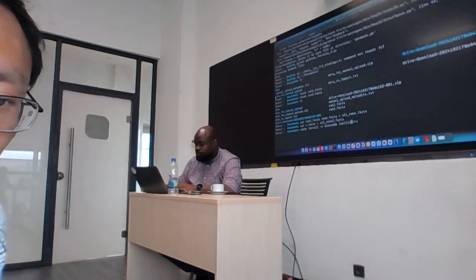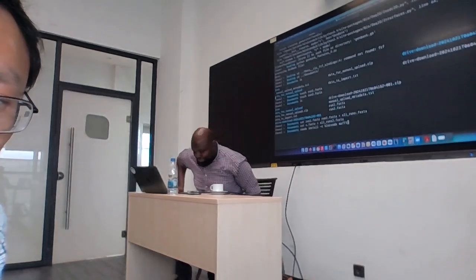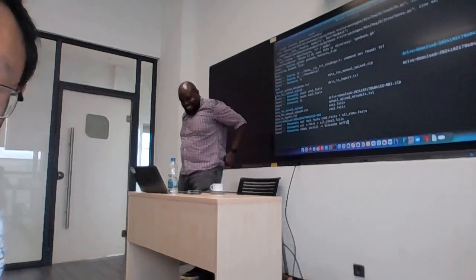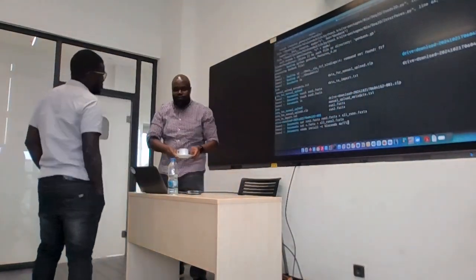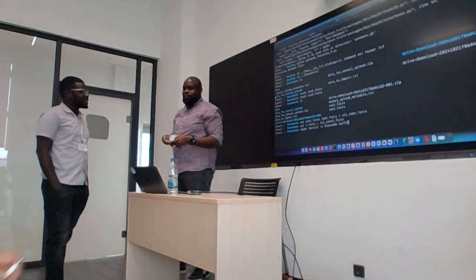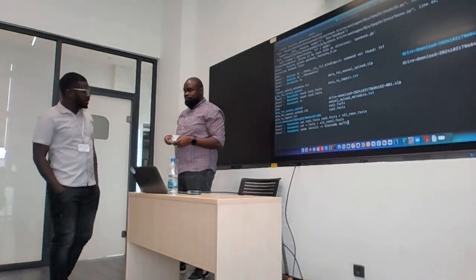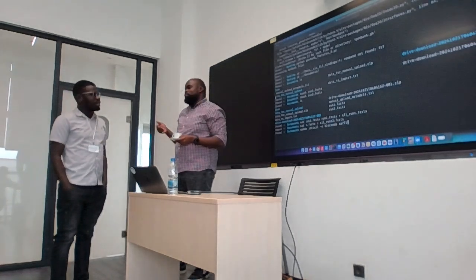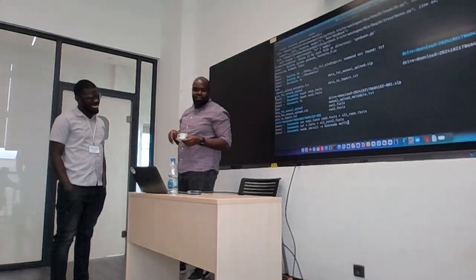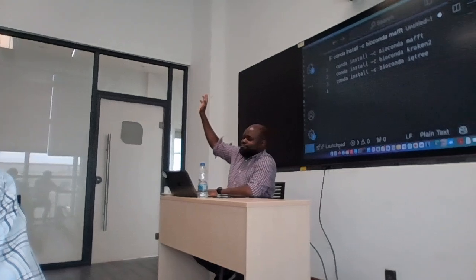Arnold, do you want to jump in here? Oh, James, give yourself a breather. Do you want to do something? Please. So do you want them to create it in a new environment? No, they can just use the same environment. Yeah. The next one. Maybe, to be honest, I'm really not obsessed about environments. Now install MAFFT.